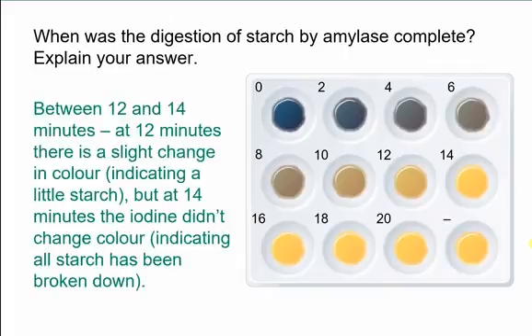So the answer should be between 12 and 14 minutes. It'd be quite easy just to say 14 minutes, but in reality that complete digestion of starch could have happened somewhere between 12 and 14 minutes. To explain the answer, of course, we can see the colour change taking place.